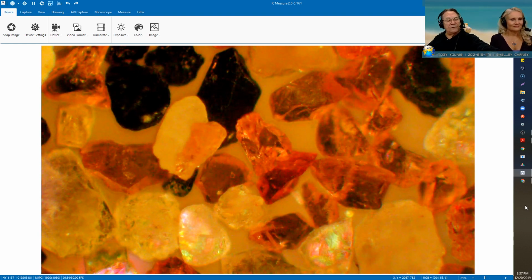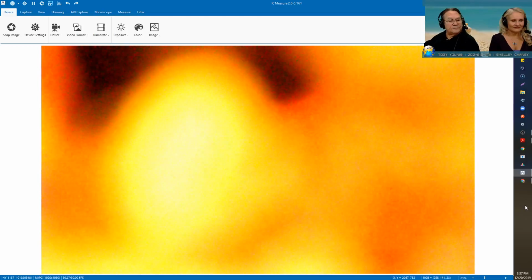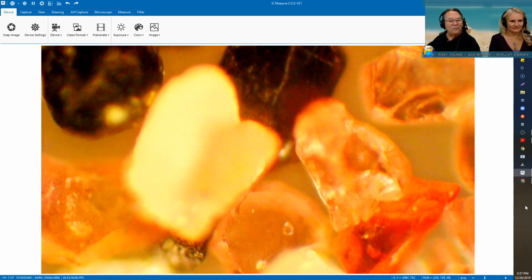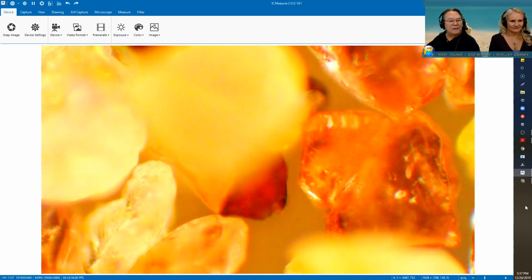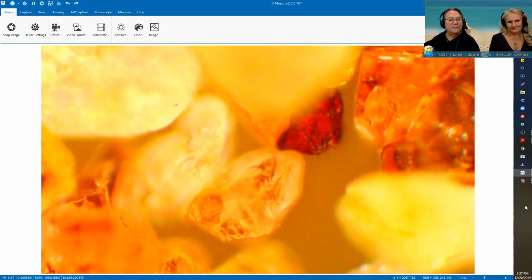But again, this is one that I found earlier, and I'm gonna zoom in on this now that I can. Let's see, is that gonna work? Yeah, just barely makes it. But as you can see here with this particular, oh no, I thought that was the same one. I'm sorry. I had one where you could see the quartz and then you could see the reddish color. And there's one that's just, I mean, if I didn't know better, I would say that's just a beautiful ruby there. So it's just got this same color. It's got what are referred to as inclusions, little mistakes in it, but it's a beautiful, beautiful piece.